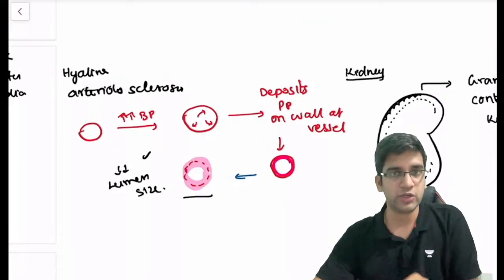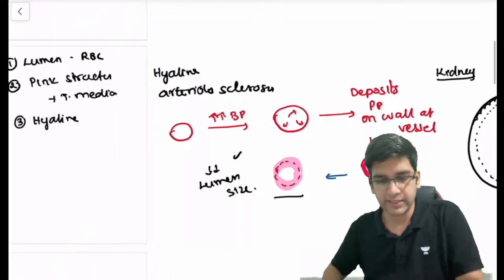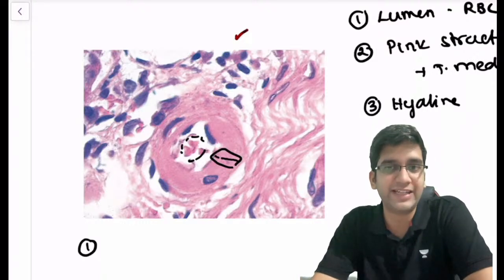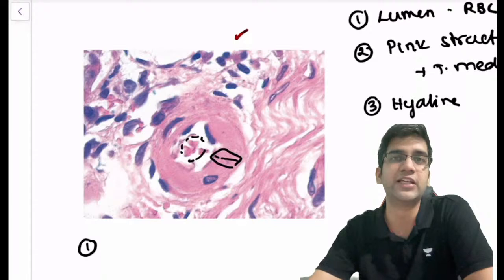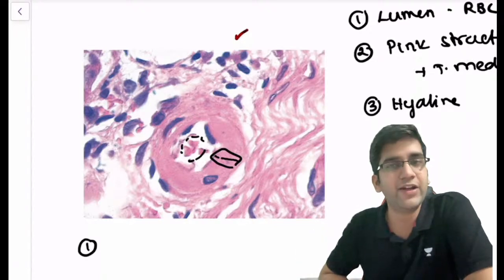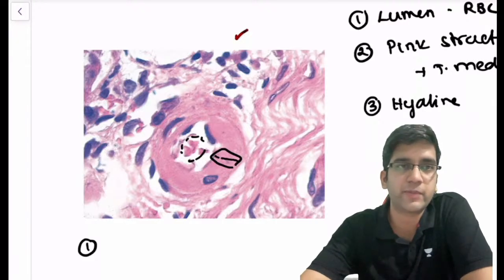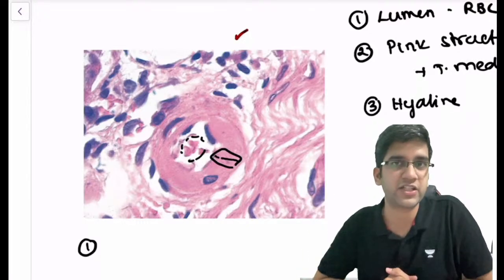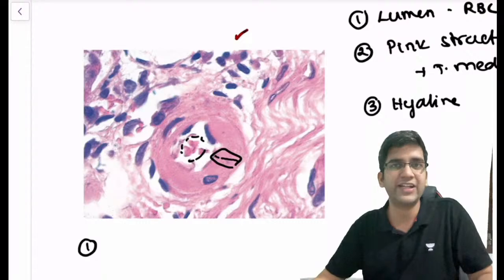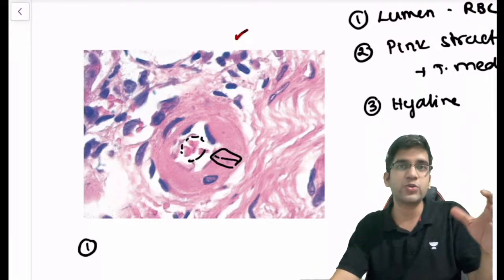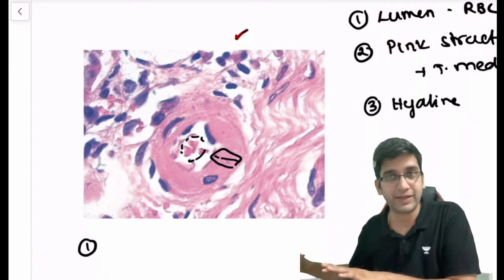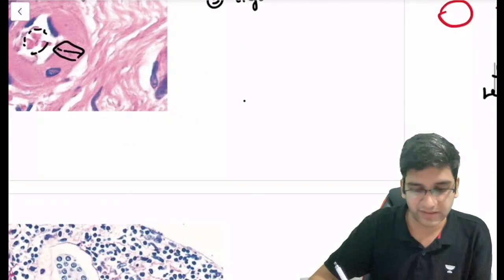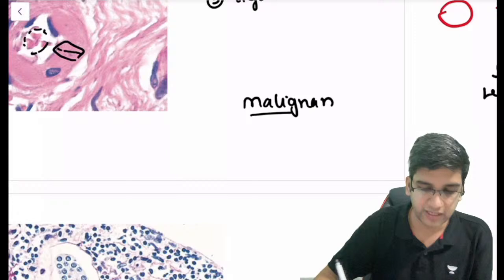So we saw two things: the microscopic image of hypertension — hyaline arteriolosclerosis — and the gross finding of granular contracted kidney. Now let's look at malignant hypertension. When do you call hypertension malignant? The blood pressure is extremely high, around 190 or 200 mmHg. Even in malignant hypertension, the target vessel is the arteriole. Let's look at the pathogenesis and imagine what will happen in microscopy.